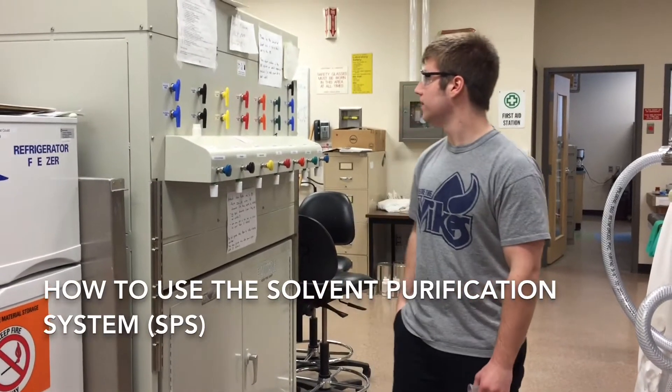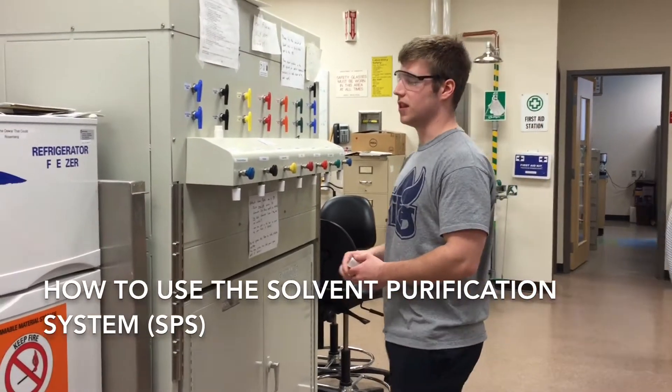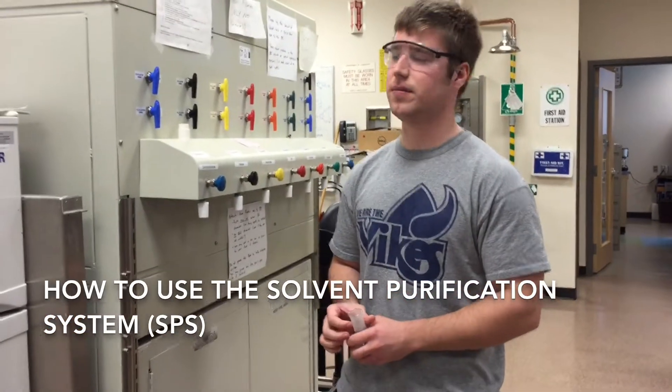Hi there. This is the solvent purification system in the Mach and Dough lab and I'm going to show you how to use it today.